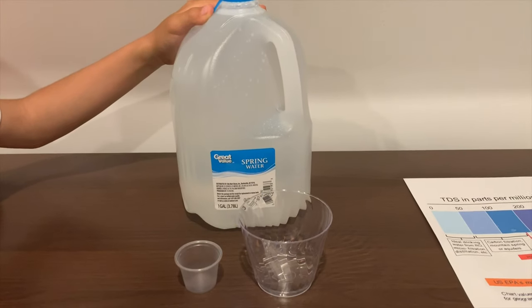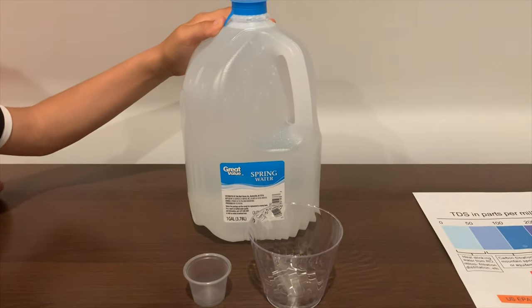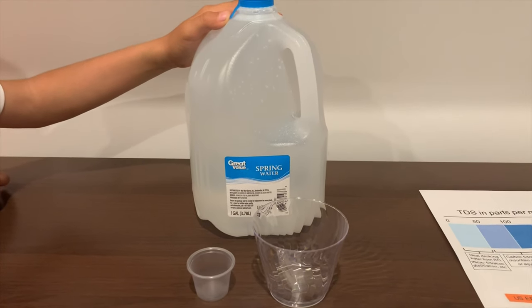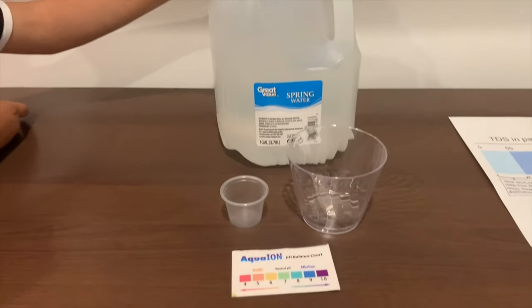This is the Great Value Spring Water. It's sourced from California. It costs $0.94 and you can buy these at Walmart stores. Let's test the pH and TDS levels.